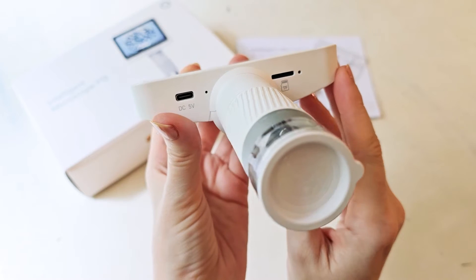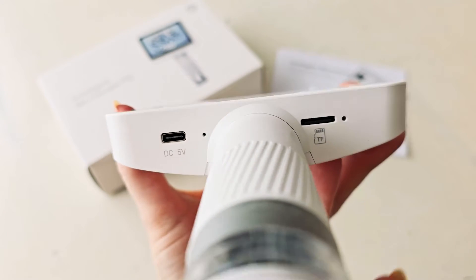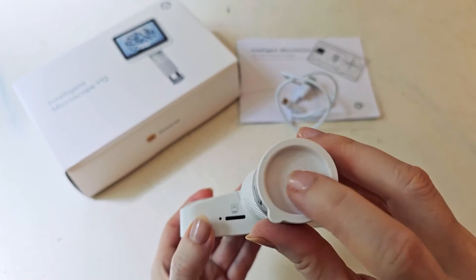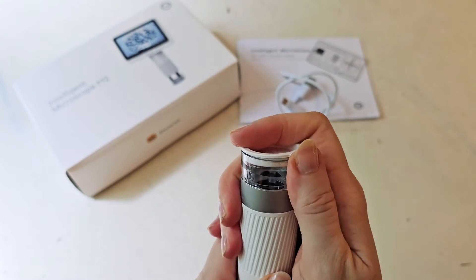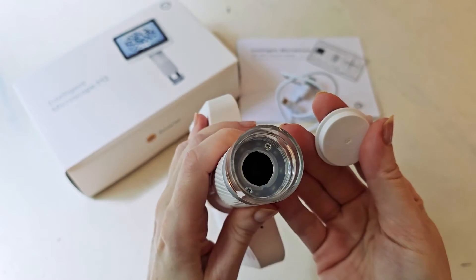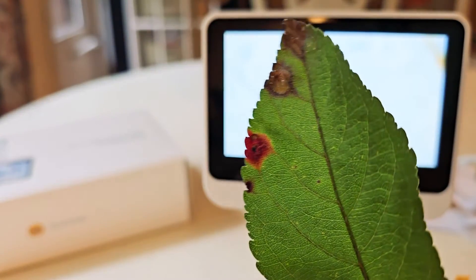Down underneath, one port is for the power cord and the other is for storage. On the bottom, there's a cap that comes off, and inside that is where the microscope lens is. You would just put that part down over whatever it is that you want to be looking at.